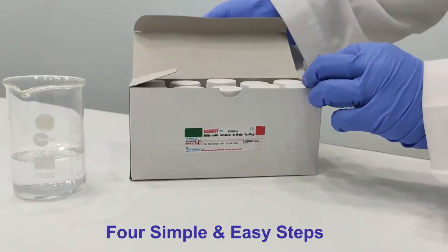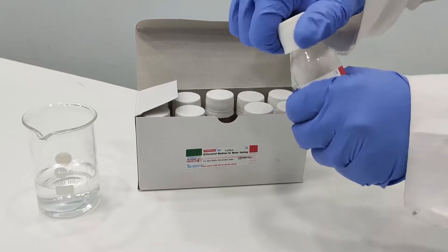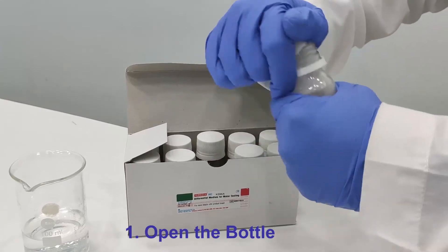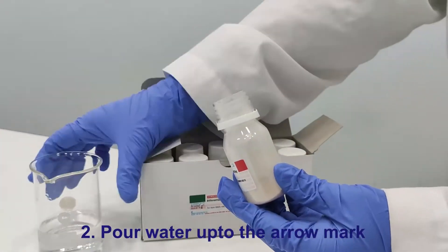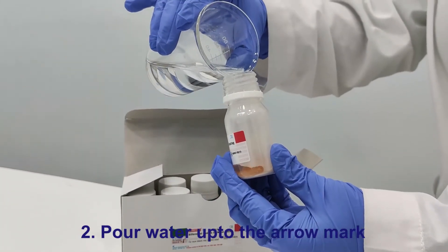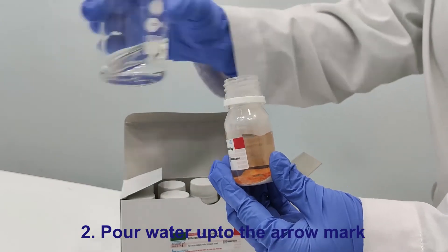It's a portable, handy testing kit with four simple and easy steps. First, open the bottle. Pour 20 ml of water for Part A, while 5 ml for Part B, up to the mark.